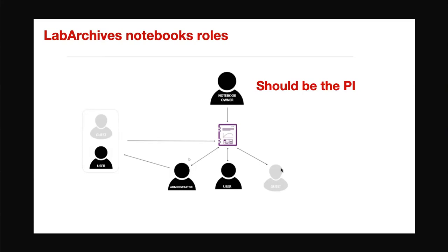So say you're doing a set of experiments with someone else, then you create a notebook, you put all the protocols and the reagents, and then you share the pages with these people, and then you give them access so they can write their own experiments in the notebook. So this possibility of having guests and multiple users is very, very important.